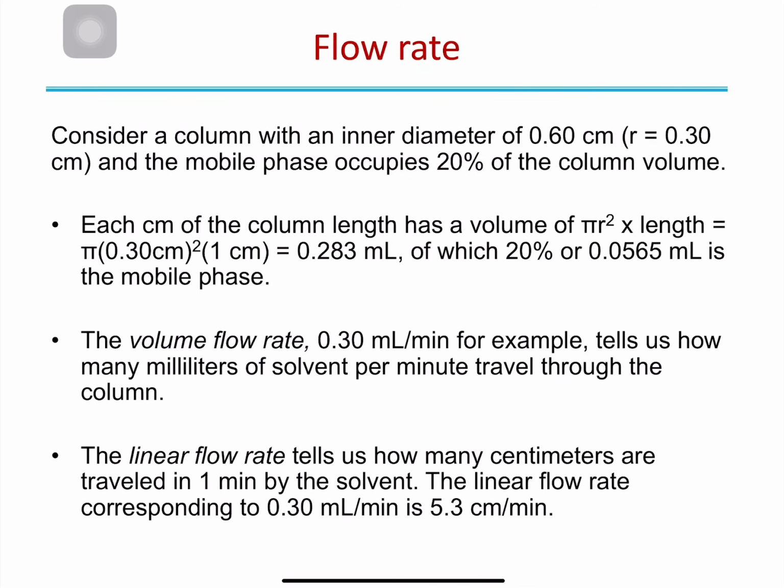One of the things that we will always encounter in chromatography is the flow rate. If you have read any paper where people are doing some type of chromatography, like using HPLC or gas chromatography, we will always find the term flow rate. So what does flow rate mean?